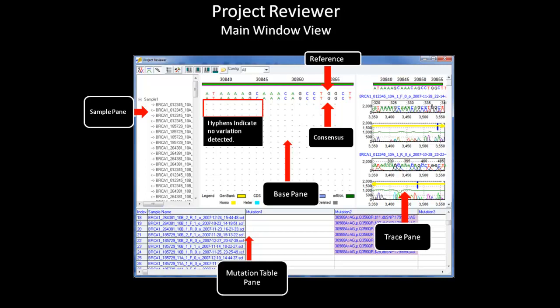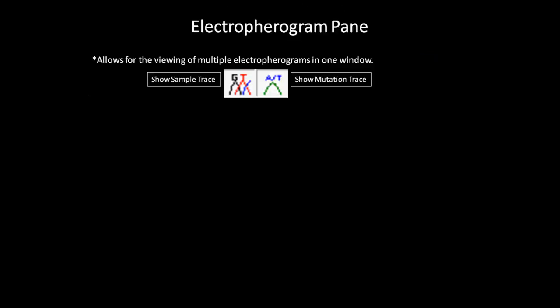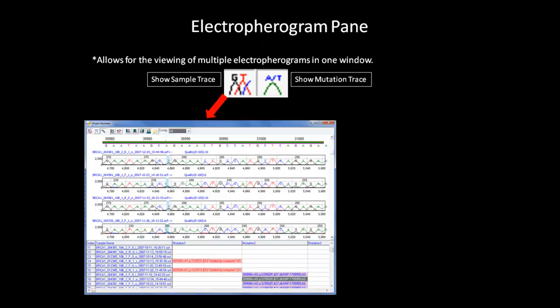You may also edit your mutation in this table, as discussed previously. In the electropherogram pane, with the icon shown here in the toolbar, you can select to show sample traces, show mutation traces, or show both. In the first example, only the show sample trace is selected. As you can see here, four sample traces are displayed at once. The variation is highlighted to show the position of the variant.